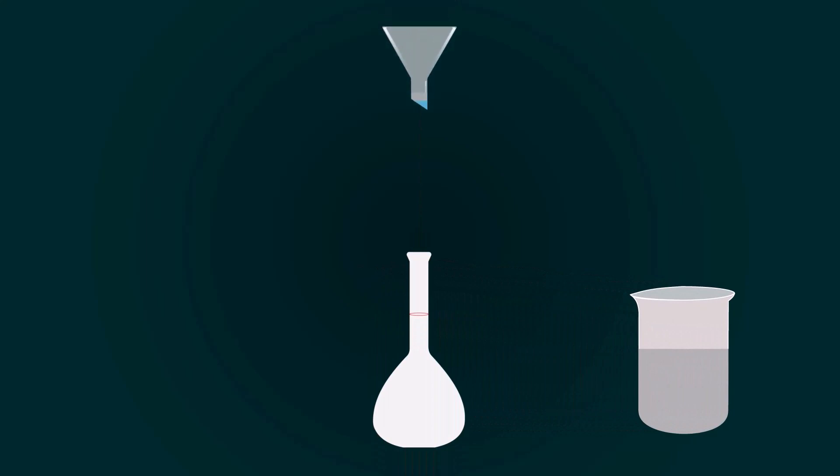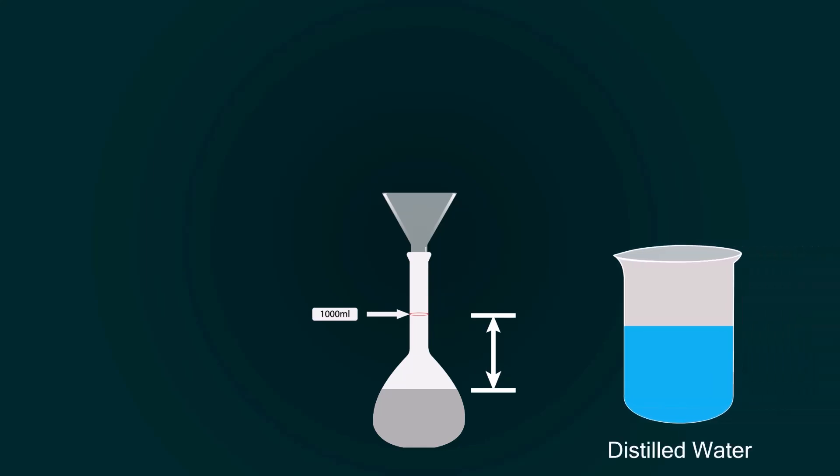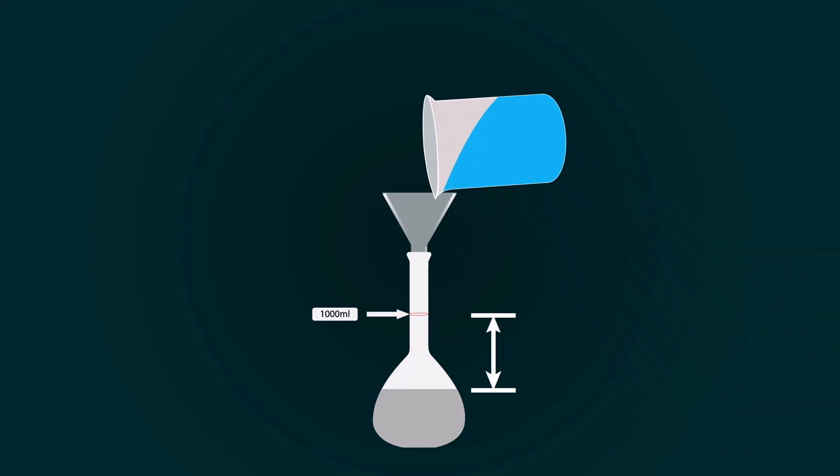Now pour all the solution into the volumetric flask with the help of the funnel. You have to fill the volumetric flask up to the thousand milliliter point, for that you have to add more distilled water. Take more distilled water into an empty beaker and start pouring it into the volumetric flask.